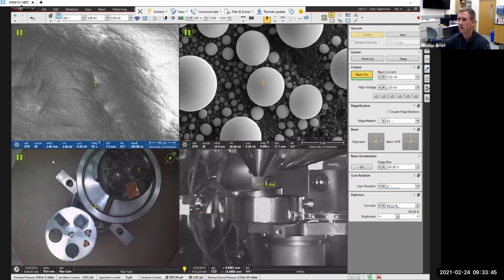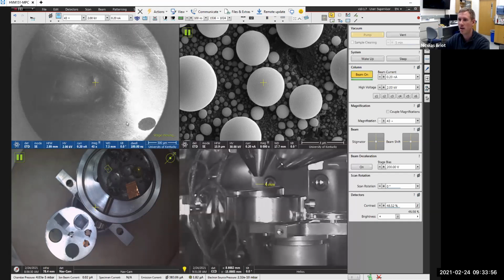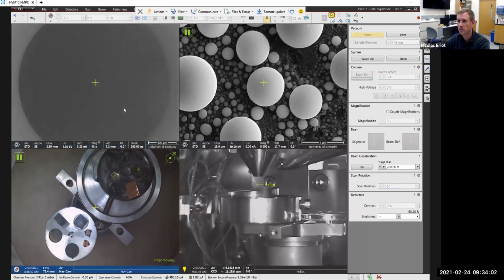But you can tell how easy it was to deal with tin, for example, or aluminum, and how difficult it gets when you get to that embedding material, or we'll get to the glass rods, of course. Once you get to the glass rods, it gets a little difficult.